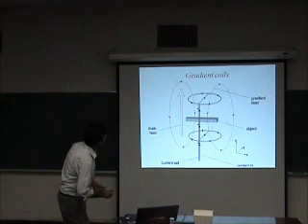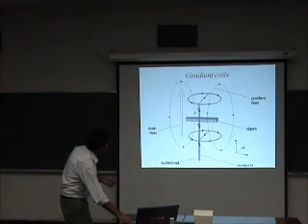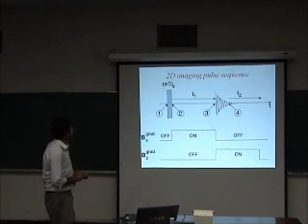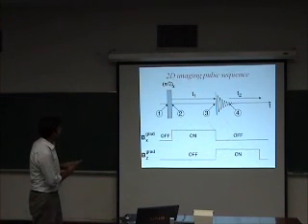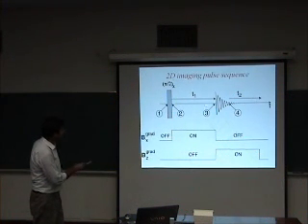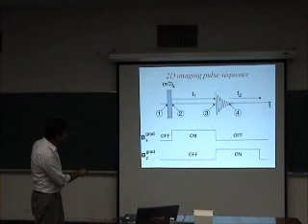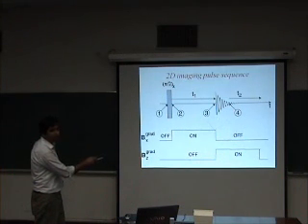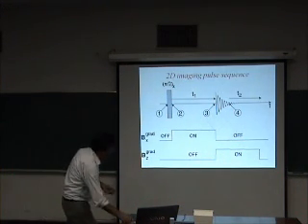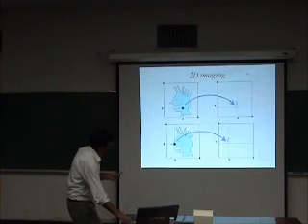In MRI you have coils that can make gradient fields. Fields are inhomogeneous along the length of the sample, along the volume of the sample. So you apply a 90-degree pulse, spins start to precess, and you turn on a gradient field in the x direction, then you turn off the gradient field, and then you turn on a gradient field in the z direction and start acquiring. This is the pulse sequence, and this is called a 2D sequence. I haven't talked about 2D spectroscopy, but it works in exactly the same manner.